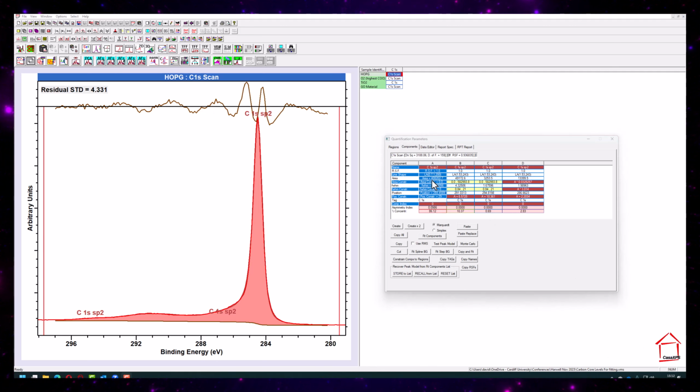So I've used this line shape for this particular example, and it seems to be pretty good. You will get subtle changes on this line, on this residual standard deviation. Although this is a larger number, in all honesty, this works pretty well, with very minimal difference in terms of applying just small tweaks to try and improve this slightly. They have very negligible differences on these relative percentages, or therefore the total percentage of an sp2 type carbon within the material.